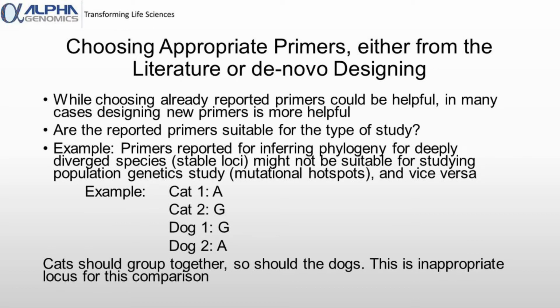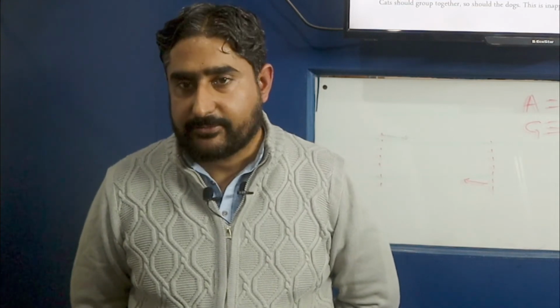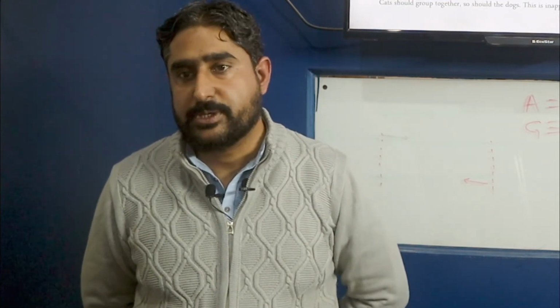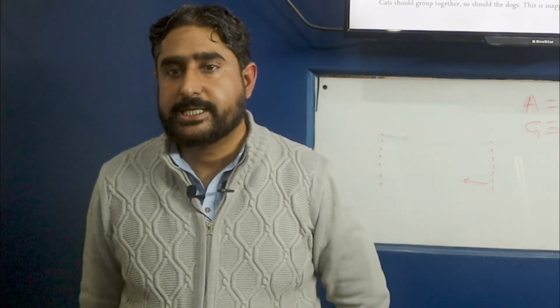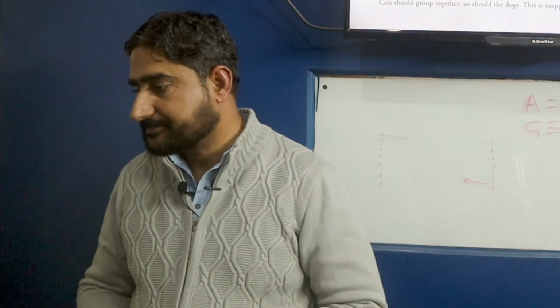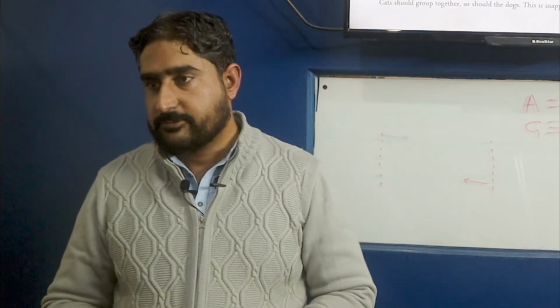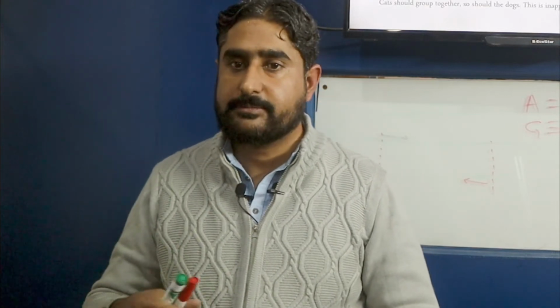Coming to this topic of choosing appropriate primers, we can pick up primers either from the literature, or we can design new primers de novo depending upon our requirements. In most cases in our lab, we have come across situations in which primers already reported in the literature don't work well, and then we have to design new primers. In my own experience, designing new, customized primers is better than using already reported primers.